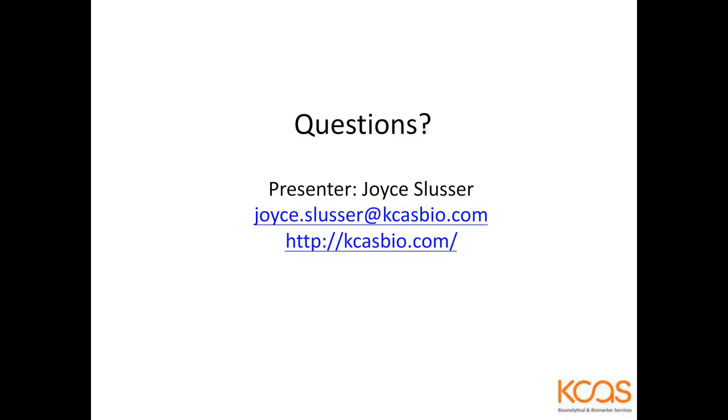Are the numbers in percentages or MFI? However you choose. So you can do median, you can do arithmetic mean, you can do geometric mean.